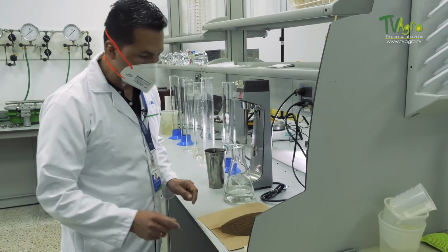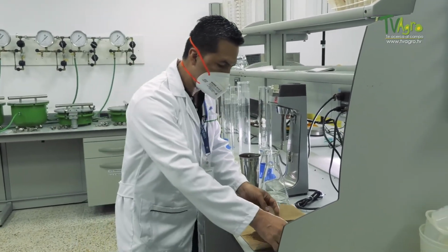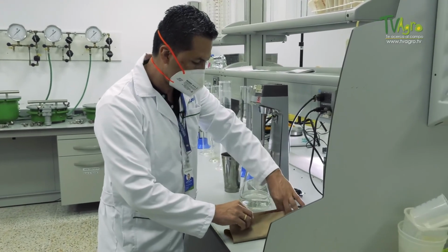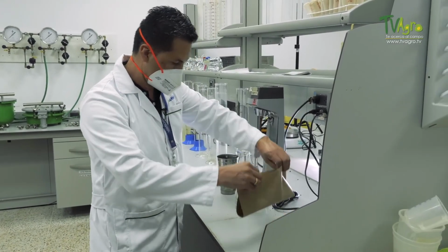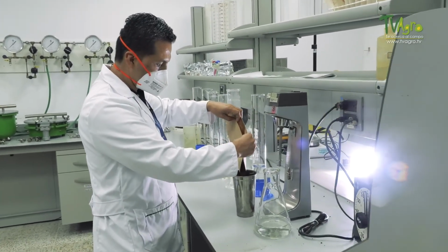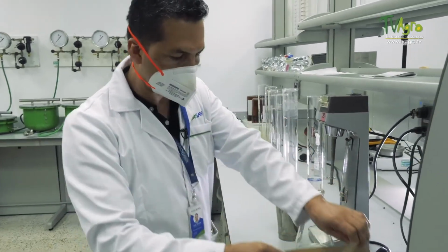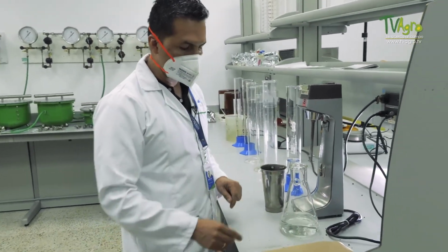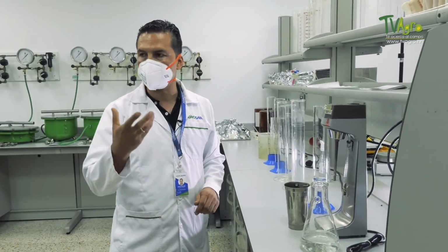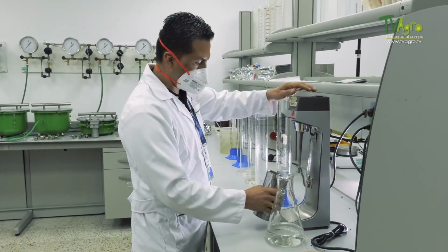Then we measure the 50 grams with a scale. We take 50 grams as such, and those 50 grams we are going to put in a mixer with a special solution, a dispersing agent that is going to make the soil particles suspended, and then by their weight they are going to decant in certain times.